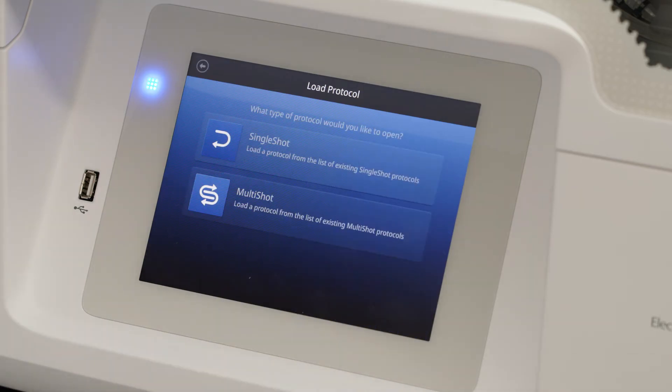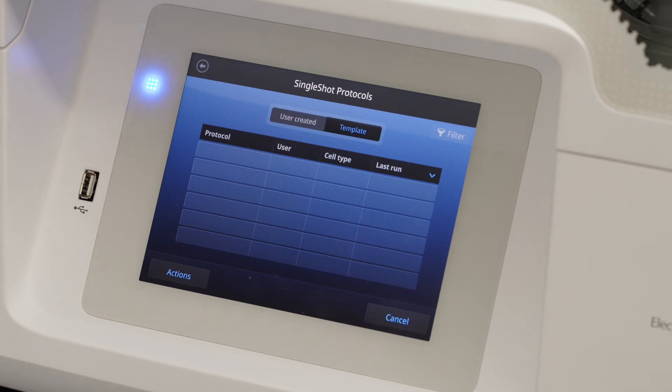Using the touch screen, select Run Single Shot to start the electroporation process.